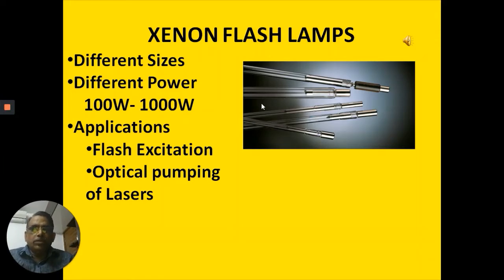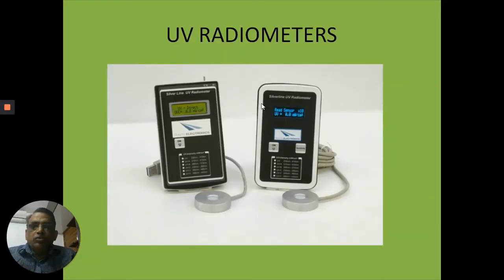Xenon, you should keep in mind, are very intense light sources, which find a lot of application in photophysical and photochemistry instrumentation. In particular, fluorimeters generally have xenon lamps. If you want to measure the phosphorescence lifetime in a spectrofluorimeter, they also have an additional flashing xenon lamp with a millisecond pulse width. So this is how xenon lamps find a lot of application in instrumentation.